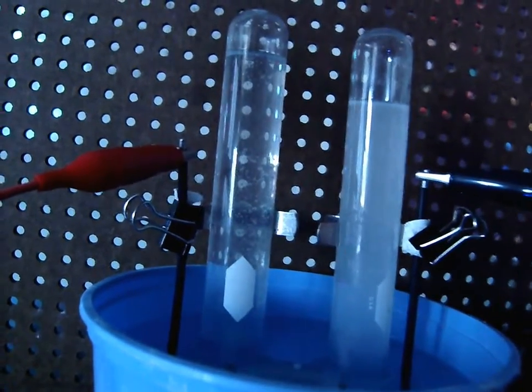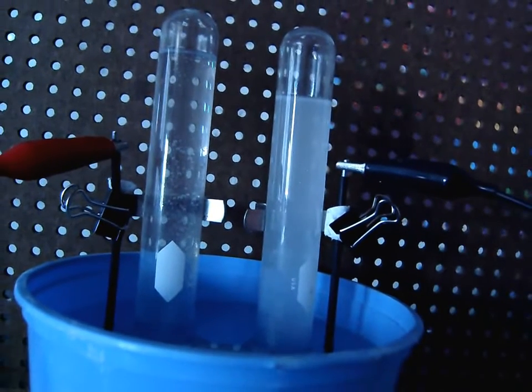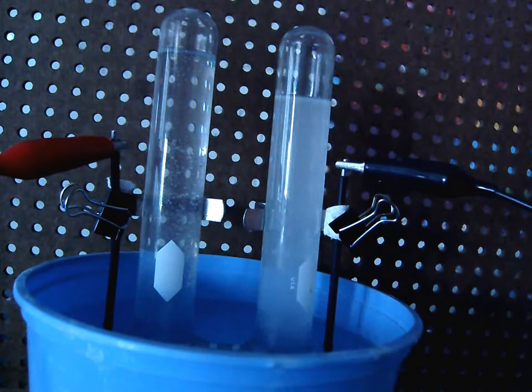First of all, it's more impressive when it goes faster. And second of all, in this class we're always limited with time. So the faster we can get something done, the better. So baking soda is what we call, in this case, we use it as a catalyst. And that's spelled C-A-T-A-L-Y-S-T, catalyst. And a catalyst is something that you add to a chemical reaction in order to make the chemical reaction go faster. A catalyst will not affect the outcome at all. It will only get us to the outcome a little bit faster.